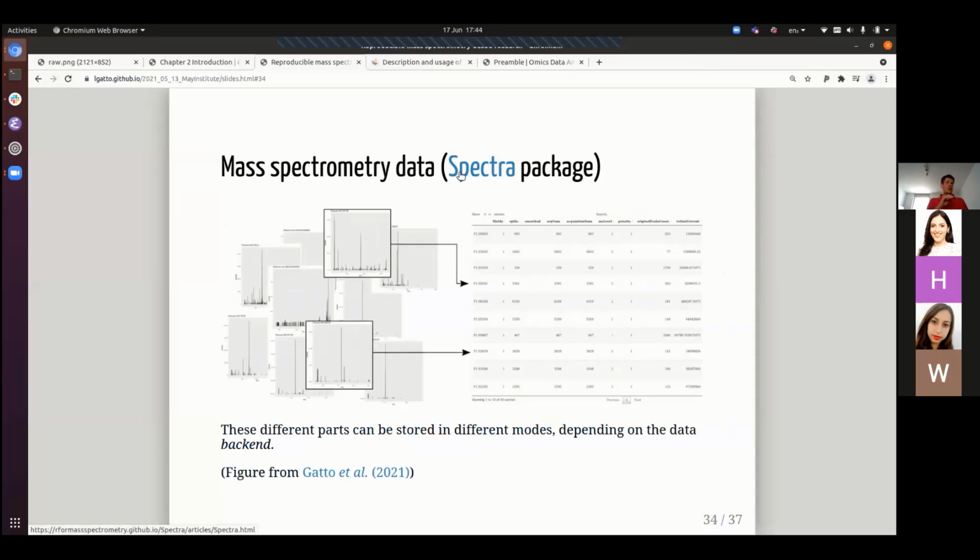So mass spectrometry data, on one hand side here, on the right, on this figure, imagine mass spectrometry data as one big table, where each row of the table corresponds to one scan. And so for each scan, we have some information. We have an index. Was it the first one, the second one, the thousandth one, the 100,000th one in our set of acquisitions?